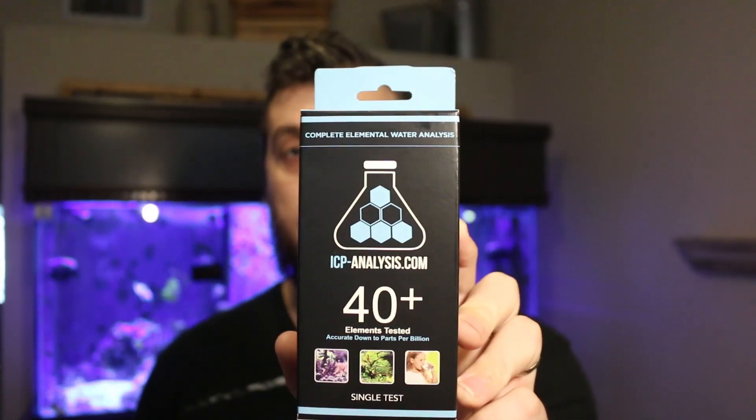How much do you really know about your tank's water chemistry? How often do you test your tank? What things are you checking for? Is it just calcium, alkalinity, magnesium? You check the pH every once in a while. Today we're going to talk about ICP testing.